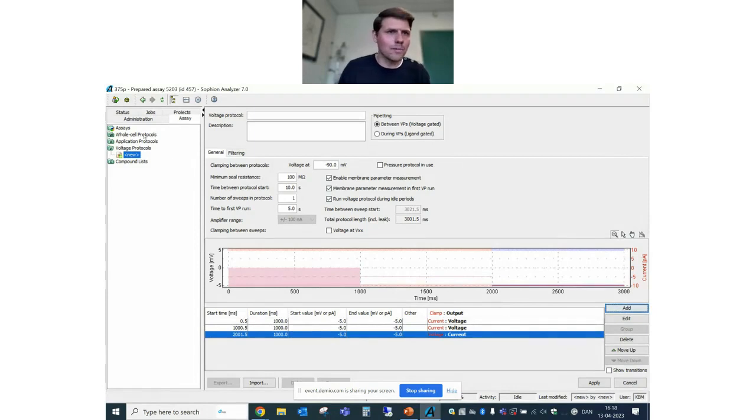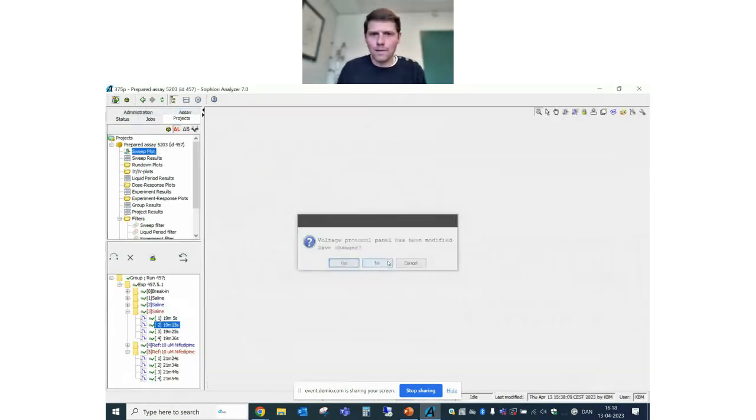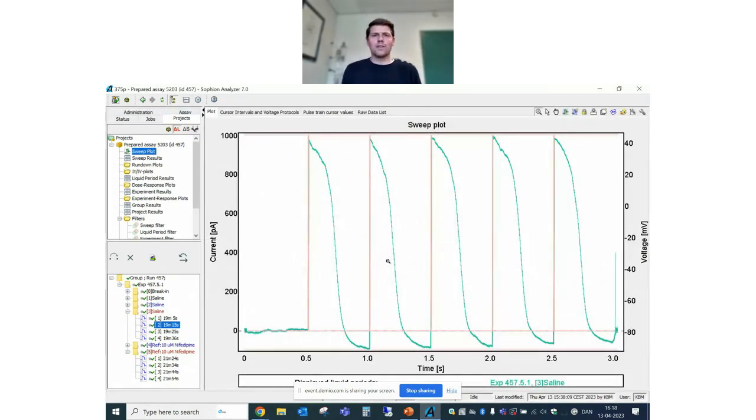And then I cannot stop myself from showing you some data as well. And I don't want to save this, because now you can record action potentials. And here I will talk a little bit more about the new analyses that are available, because we would like to get more advanced here.